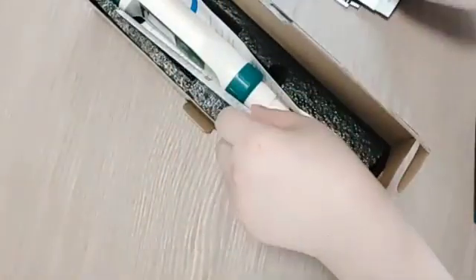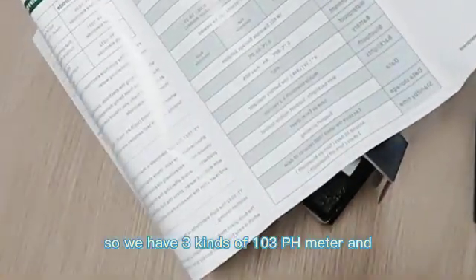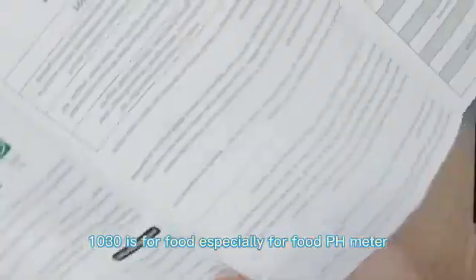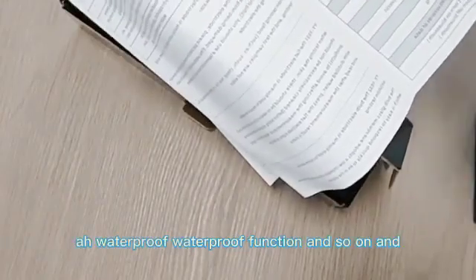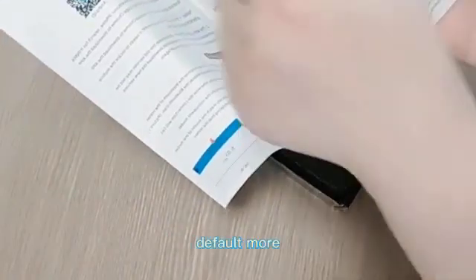This is our manual book. We have three models: 103, DM, and the 1030. The 1030 is especially for food — it's a food pH meter. You can see the measurement range, waterproof function, and so on, as well as the different default models and operation instructions.